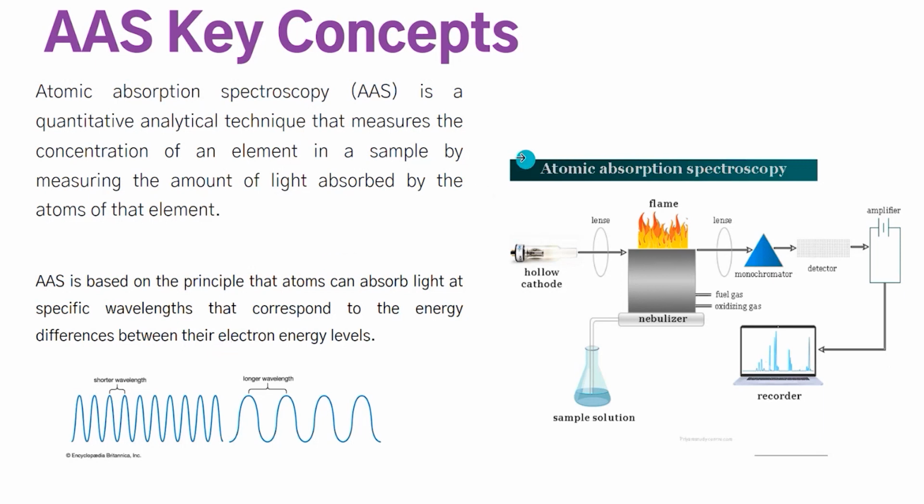So this picture here shows an example of a setup for atomic absorption spectroscopy.